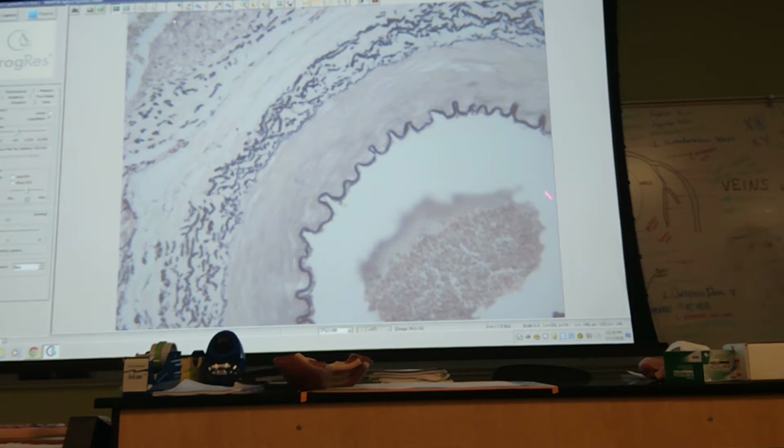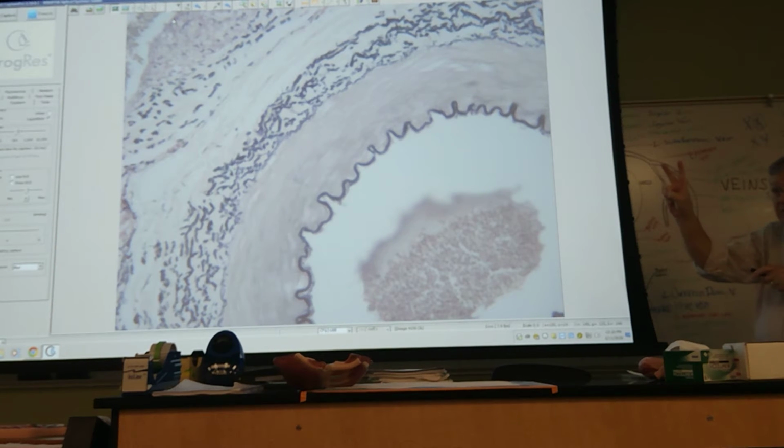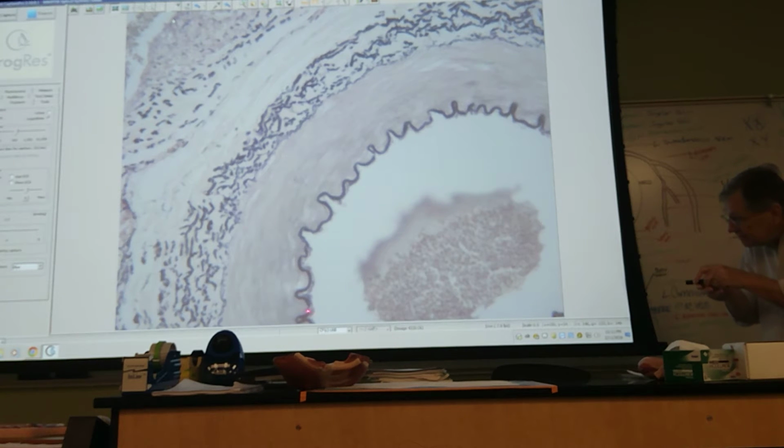Okay, and we could be completely bored and go all the way around. But that's not what's in contact with the lumen. There's an actual layer inside of that. It's called simple squamous epithelium. Simple squamous epithelium. Looks like junk inside the internal elastic membrane. You remember, simple squamous. What's that mean? Single layer, very flat cells, right? You recall from 212? And here it is.